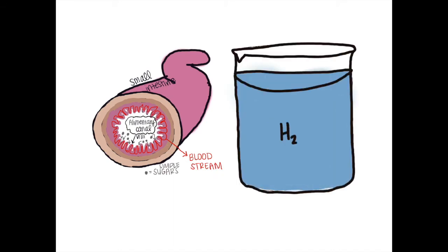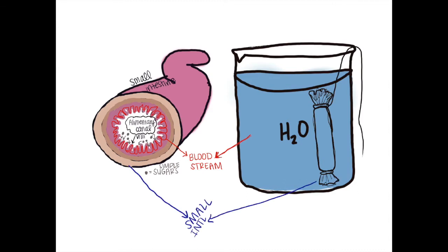Now we need something to represent the bloodstream, which is where all those tiny broken down molecules go after leaving the small intestine. In this case, the bloodstream is going to be the water that we're going to set the dialysis tube into.